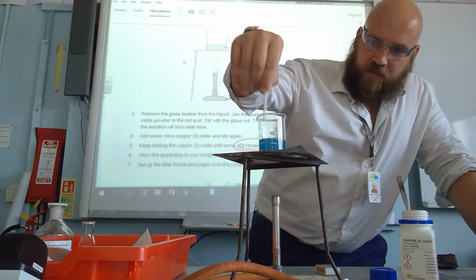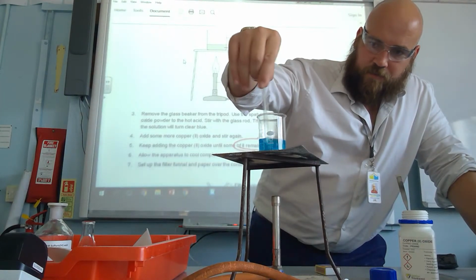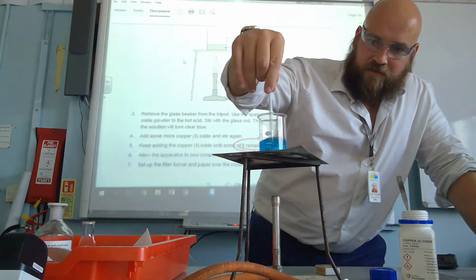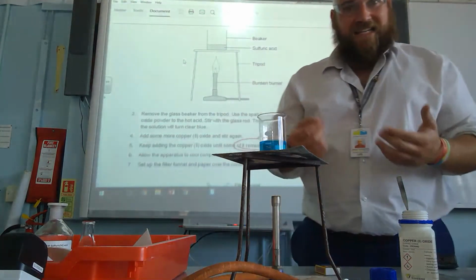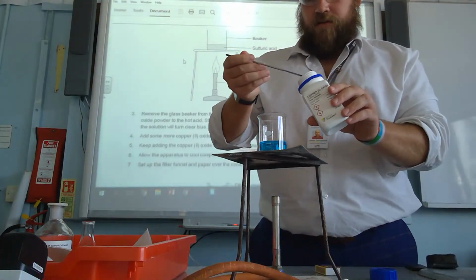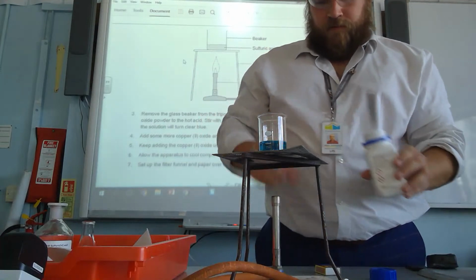no more will dissolve. So you can see that it's just about, now I reckon I can get some more to dissolve in that. You'll notice the color has changed as well. And there's no more black solid in it. So that means that it can take some more. I'm just going to keep adding the black powder until there'll be no more. So let's put that in.